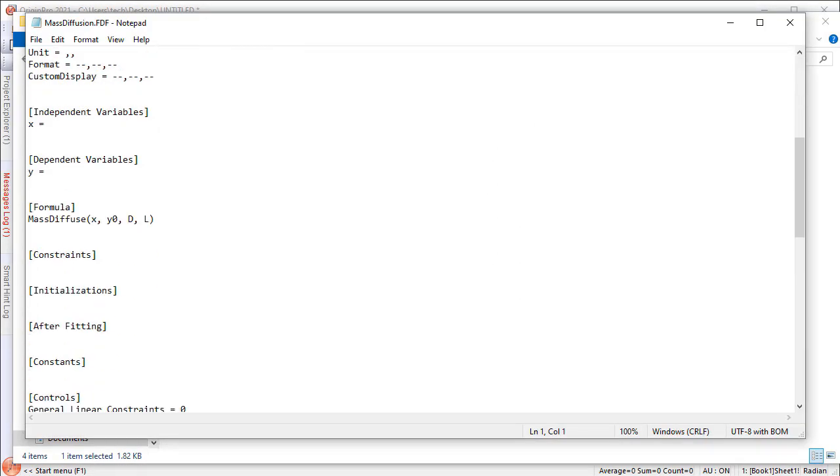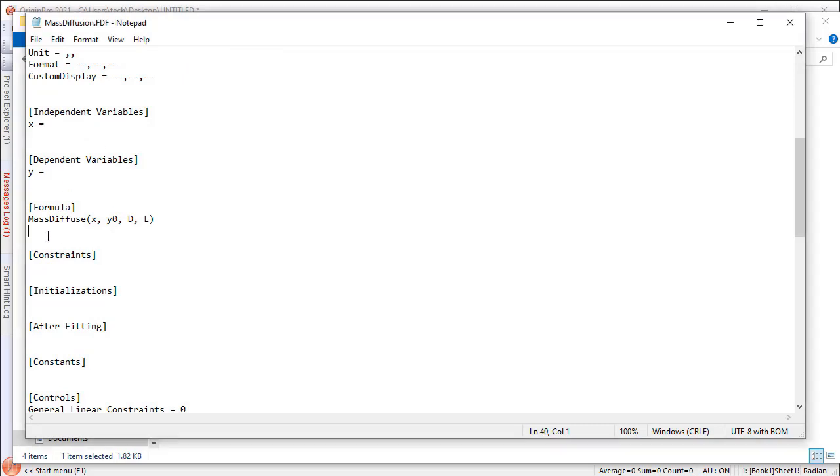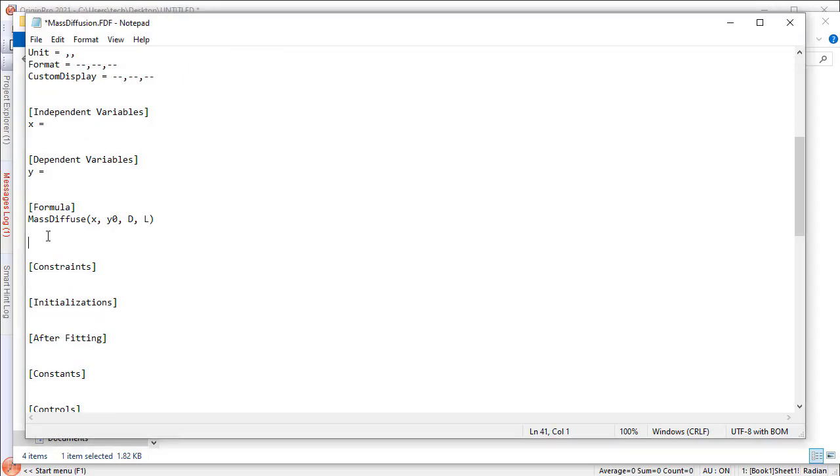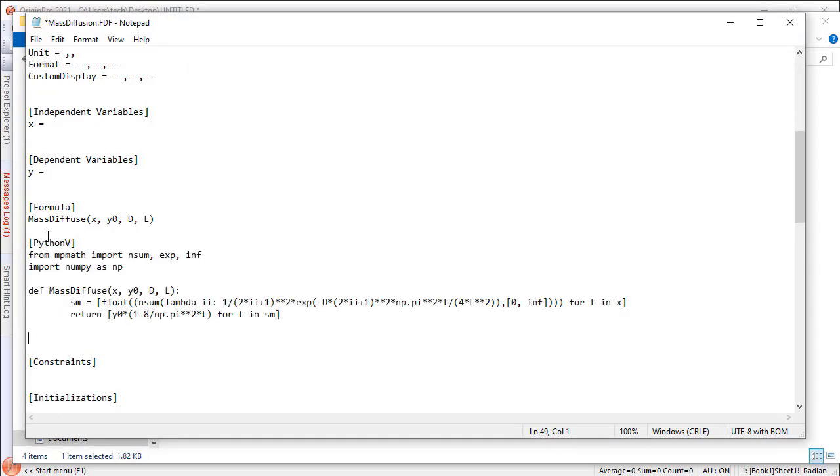Locate the formula section and add a new Python V section below, which contains the fitting function body written in Python script.